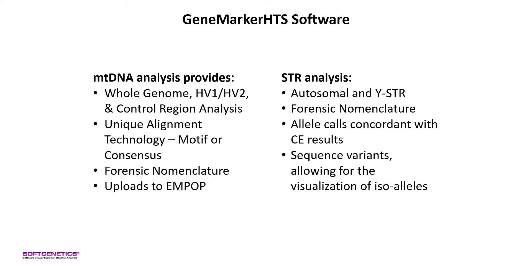The STR application allows for analyzing autosomal and YSTRs using forensic nomenclature. Allele calls are concordant with CE results but also include sequence variants to visualize isoalleles.